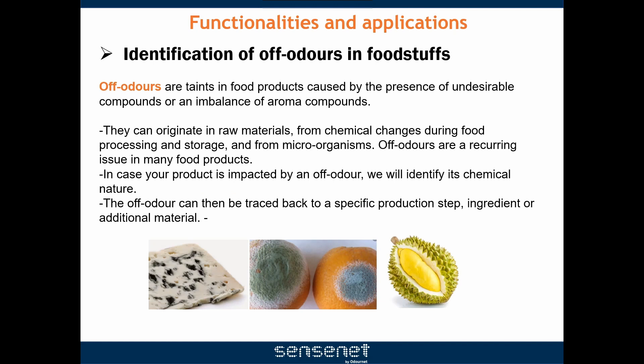Identification of off-odors in food: off-odors are taints in food products caused by the presence of undesirable compounds or an imbalance of aroma compounds. They can originate in raw materials, from chemical changes during food processing and storage, and from microorganisms. Off-odors are a recurring issue in many food products. In case your product is impacted by an off-odor, we will identify its chemical nature. The off-odor can then be tracked back to a specific production step, ingredient or additional material.